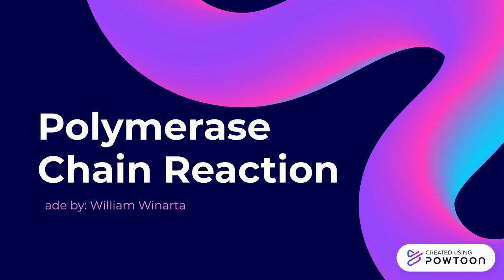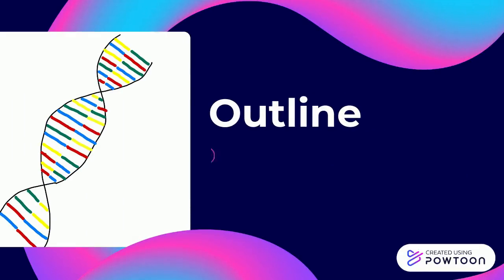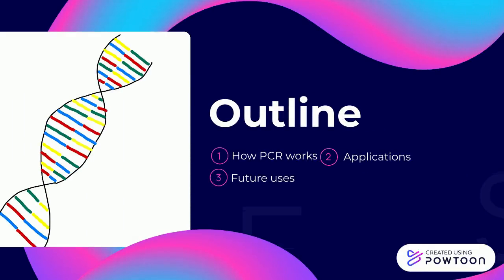This video is about the polymerase chain reaction, better known as PCR. Today we'll be going over how PCR works, applications, and future uses.